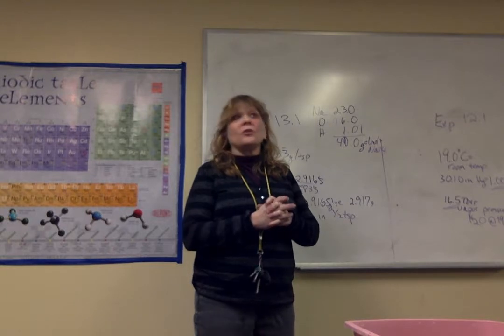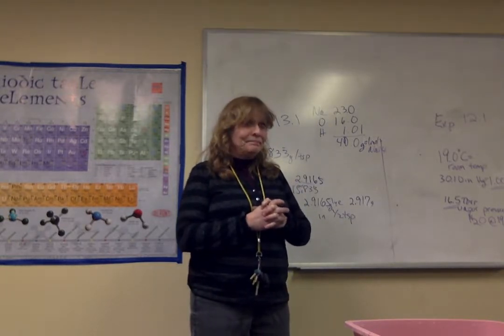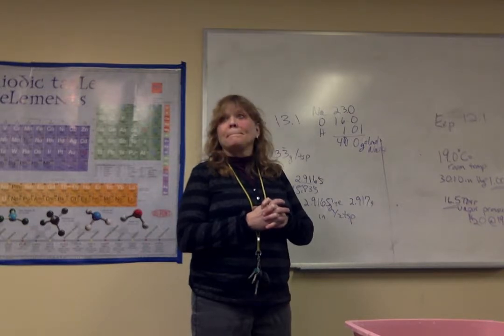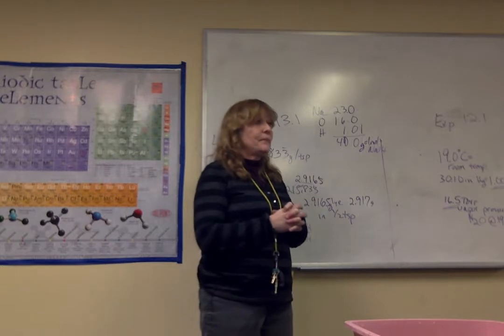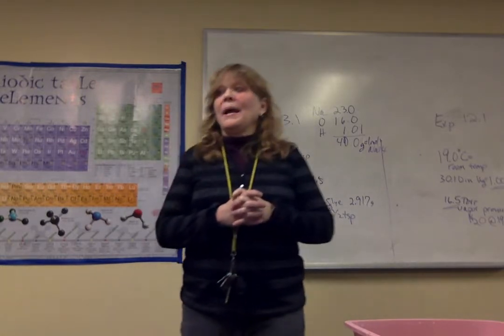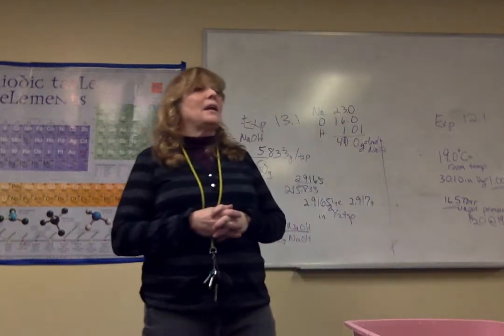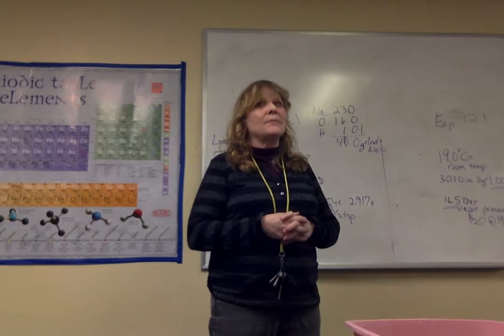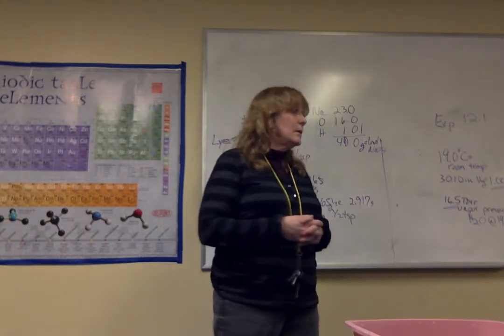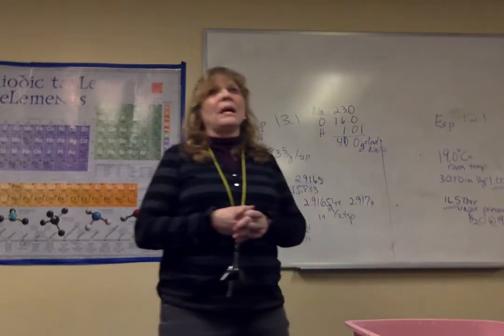You have your T initial, your T final, which said T final, I'm going to say 30.3 degrees Celsius. And then your T initial you already have, right? You have to do your delta T. Your mass is going to be the mass of the lye plus the mass of the vinegar. The mass of the vinegar you have to calculate by 100.0 cc's times 0.99 grams per milliliter, and you're going to wind up with 99 grams of vinegar.